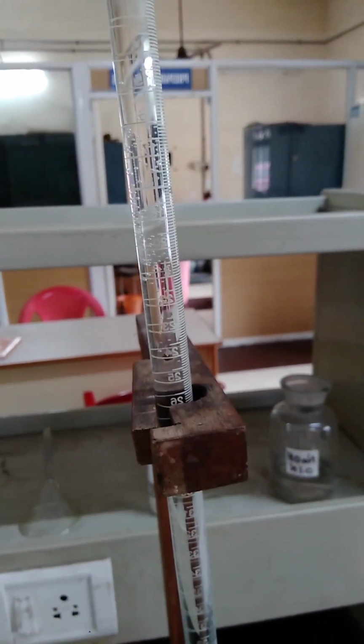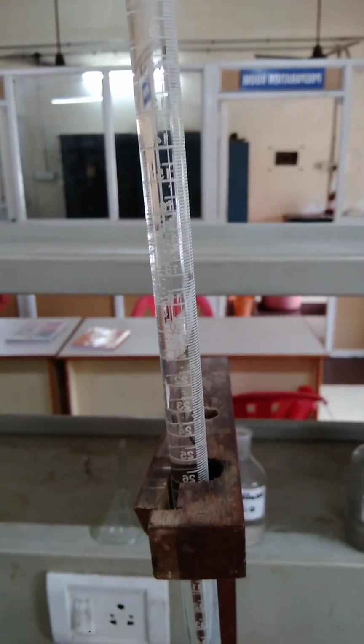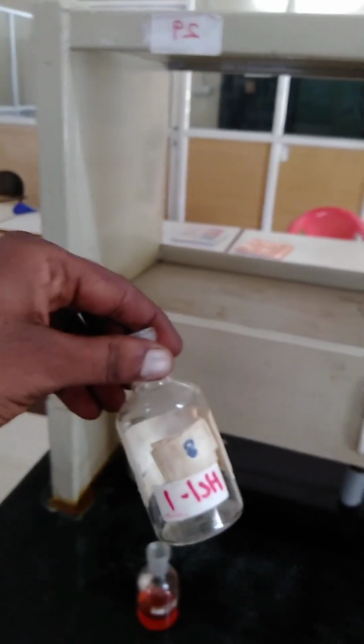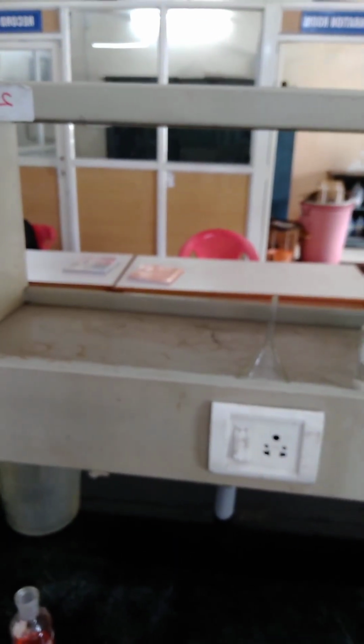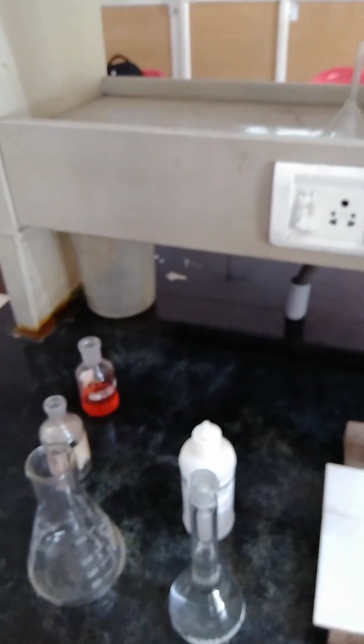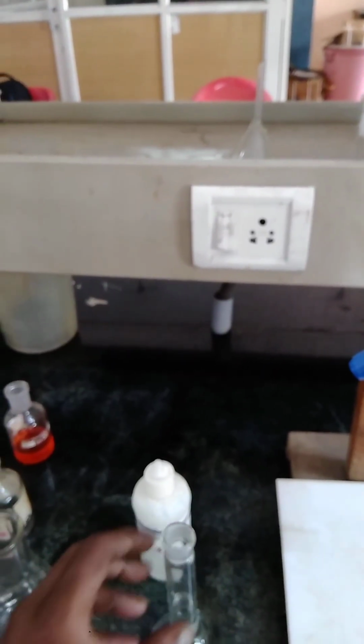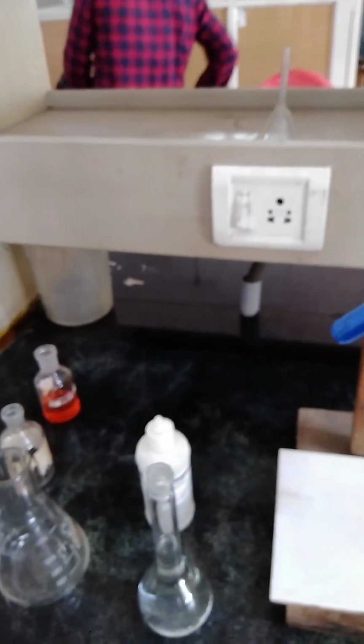Then note it down. Then wash the apparatus. Then go for the next titration. Once you get the concordant value, get it attested. Then do the calculation. According to the demonstration, the makeup is very important. If you do it clearly without any mistakes, without spilling the solution from the reagent bottles, you will have no chance of getting an error. You will get 100% accuracy. So the makeup is very important to get the exact value.